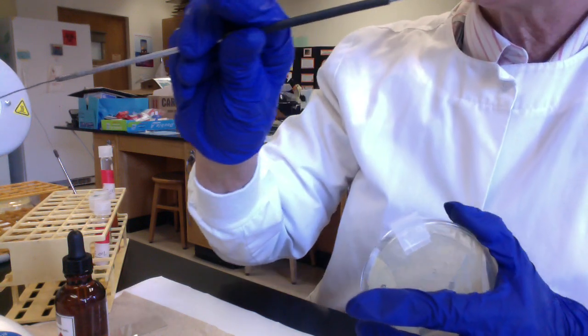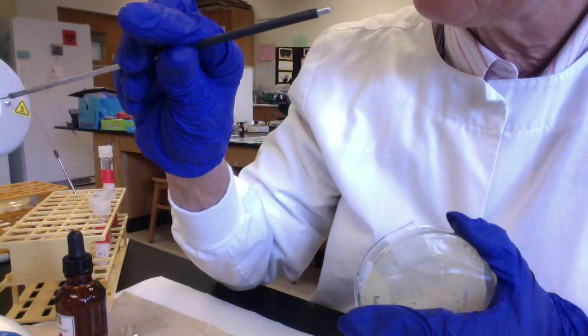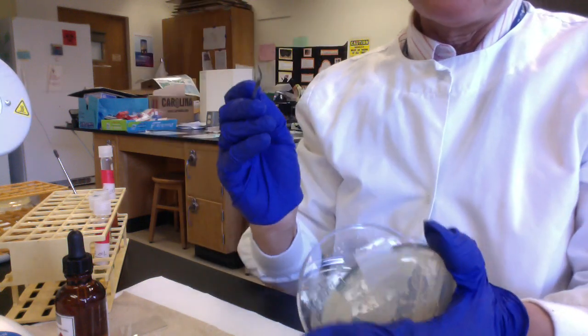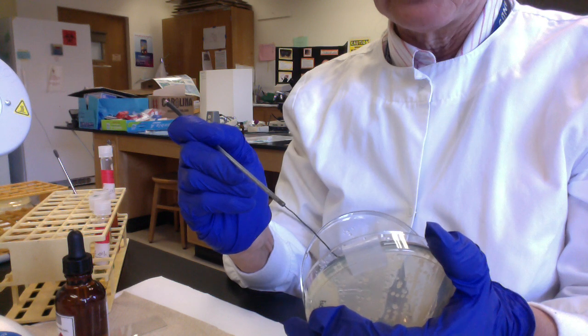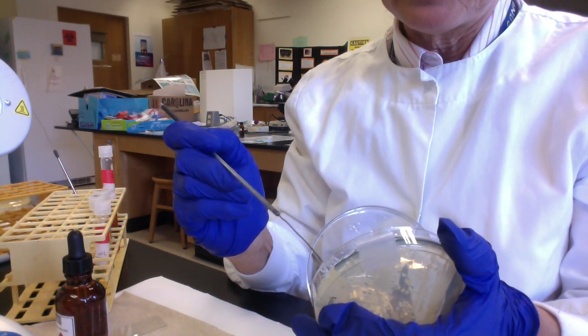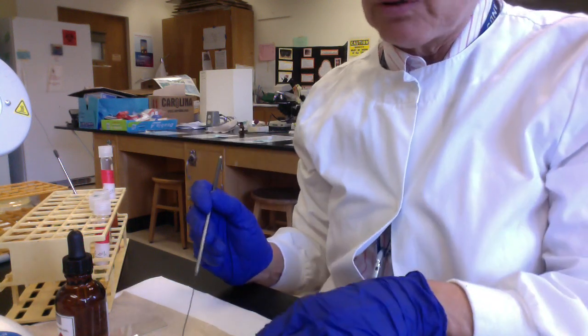Okay, so I want to make sure that I sterilize my loop, because we always use aseptic technique. I touch my plate to make sure it's not too hot. Okay, make sure it doesn't hiss and spit. And I'm just going to harvest some of the E. coli from my plate. And then it's real simple, folks. I just smear my E. coli onto my indole dry slide.